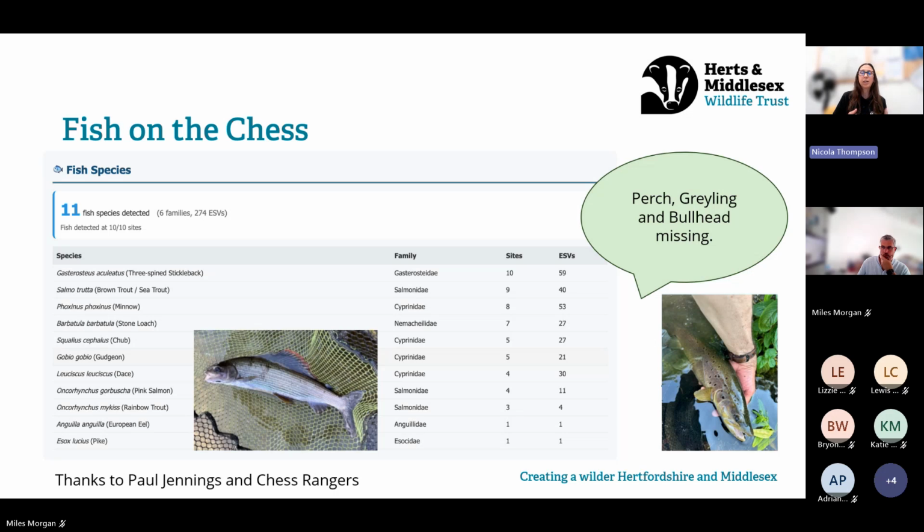It could be that it wasn't in the water of the sample that was taken and that they were somewhere else, or it could be that perhaps this is an example of where you want to do multiple sampling so that you get a wider sample, basically. So you might take 3, which is what you would normally do in a scientific study. So a triplicate. That might help show that up. But it is interesting that it's not picking everything up, but it did pick up quite a fair few of the species there. Next slide, please.